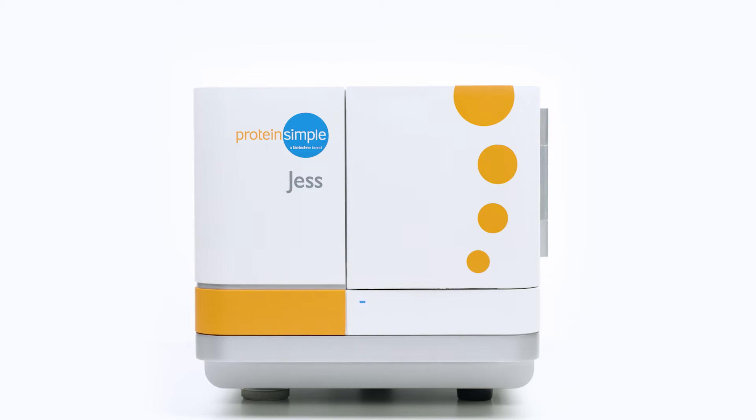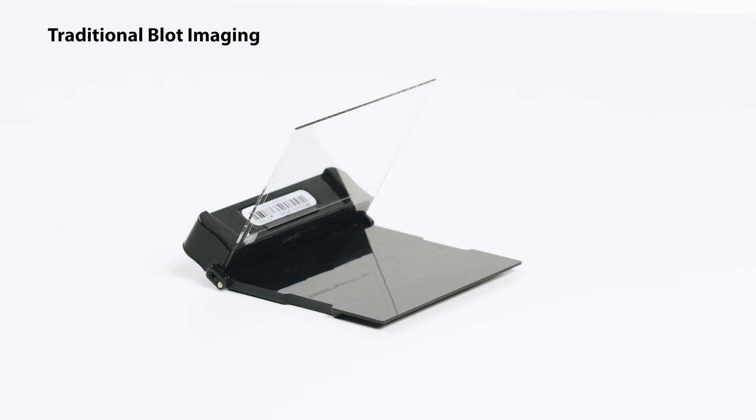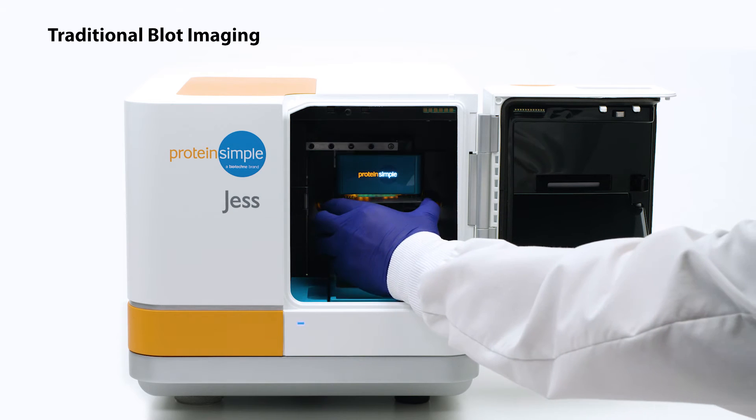And if you're still doing traditional Westerns, get the picture with Jess's in-built blot imaging system.